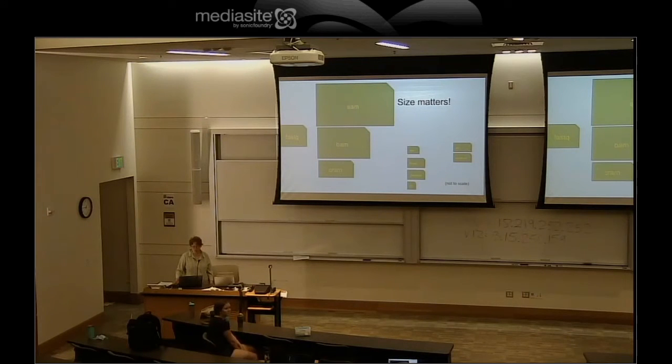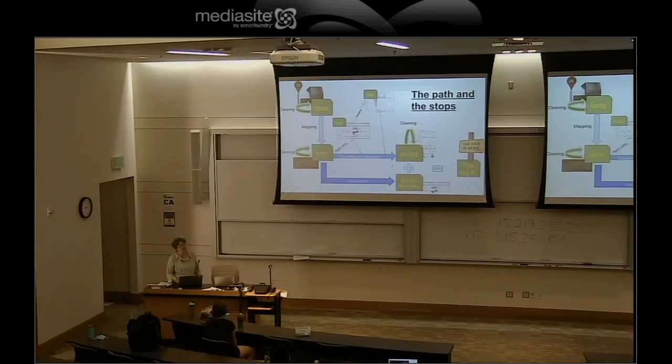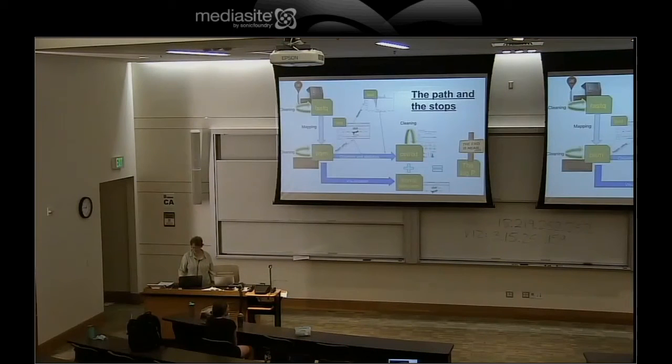Okay? So we're going to talk about the file sizes and what parts of the path. Today we've already gotten through FASTQ and a BAM. We're going to be counting and creating counts, either a CSV or text file. And at that point, you can then move to your own personal computer because it is small enough to deal with the data on your computer. Who here is going to be on Fiji when they're done, meaning BioFrontiers people? You guys, there is a Fiji visualization RStudio, meaning in RStudio you can run off of the supercomputer. Most supercomputers don't have that. And so if you want to use RStudio, you'll be doing it on your own laptop.